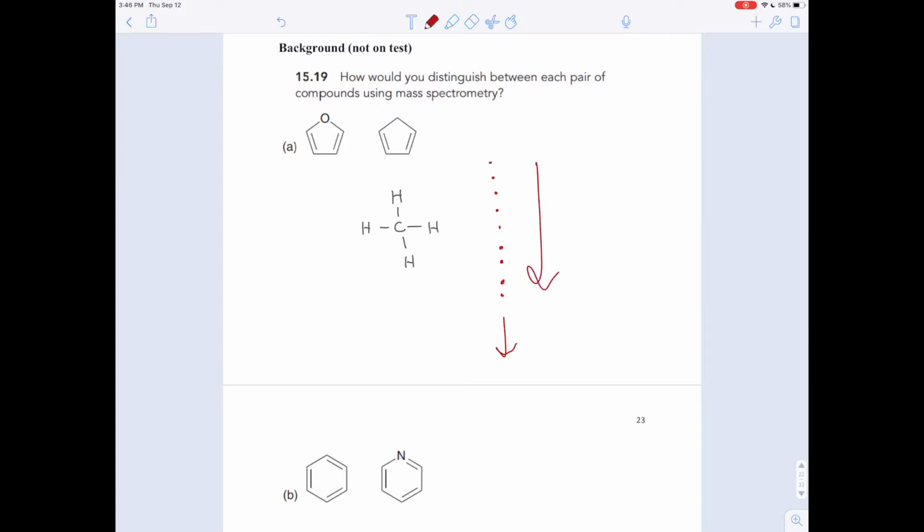So they're traveling down, shooting out. Usually how those are made, although they can be made in several ways, but one of the ways that those are made is you can take a metal and just heat it up. And the electrons in a metal aren't stuck around individual atoms. They travel over all the nuclei in the entire metal. And so as you heat a metal up, they move faster and faster, and the nuclei vibrate faster and faster, and eventually they knock out these electrons.